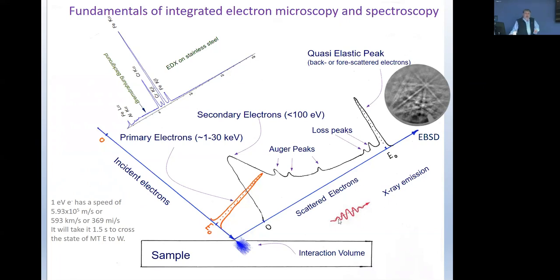The extra energy released as a result of this electron filling the hole comes out in two ways. X-rays are emitted about 75% of the time, but the other 25% of the time, Auger electrons are emitted. Their energy typically runs from, say, 20 eV all the way up to 2000 eV. They are specific to the material from which these Auger electrons come, same as these X-rays.